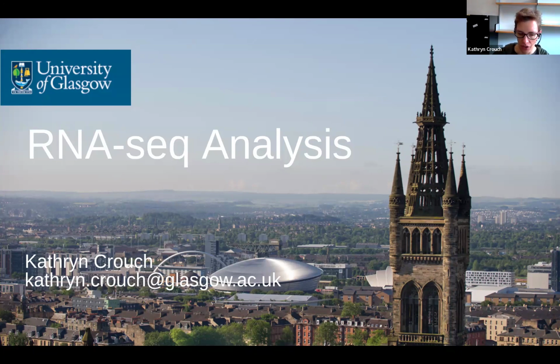On Thursday, before your group projects start, you will have two exercises to do, which both use RNA-seq data. You will have already looked at some RNA-seq data earlier in the course, but these ones dig into it a little bit more. So before you do those exercises, I just wanted to go over some basics about what RNA-seq data actually is and how we generate it.